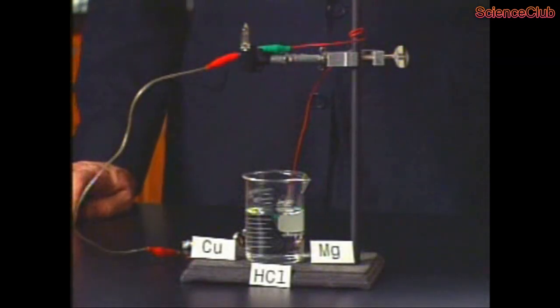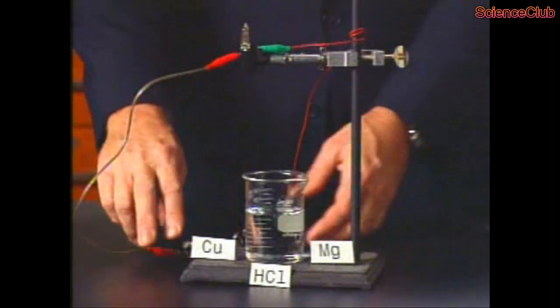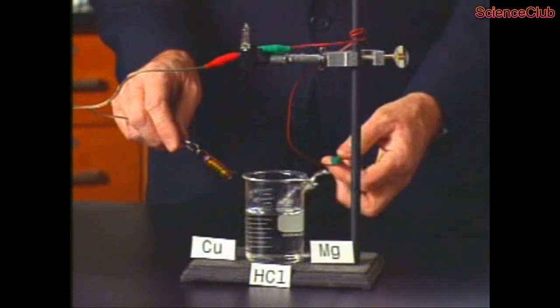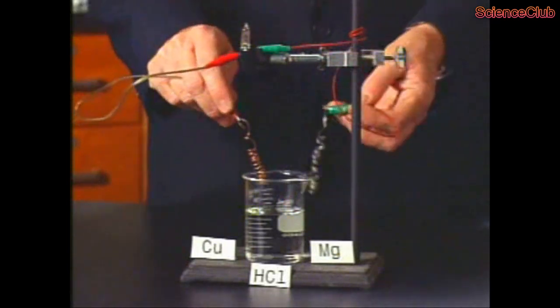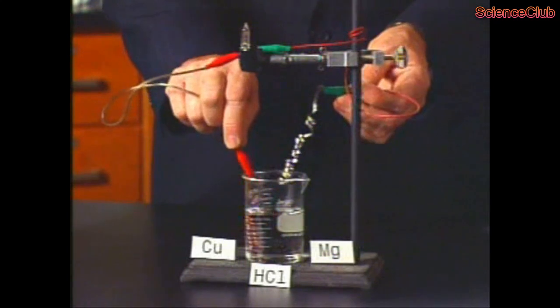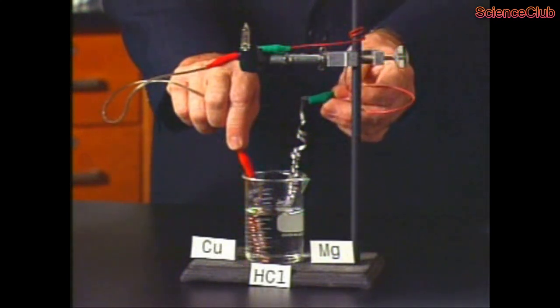To demonstrate that a voltaic cell will generate an electric current, we have a flash bulb attached to a piece of copper wire and a piece of magnesium ribbon. We're going to lower these into hydrochloric acid, first the copper wire and then the magnesium ribbon. An electric current will be generated which will ignite the bulb.